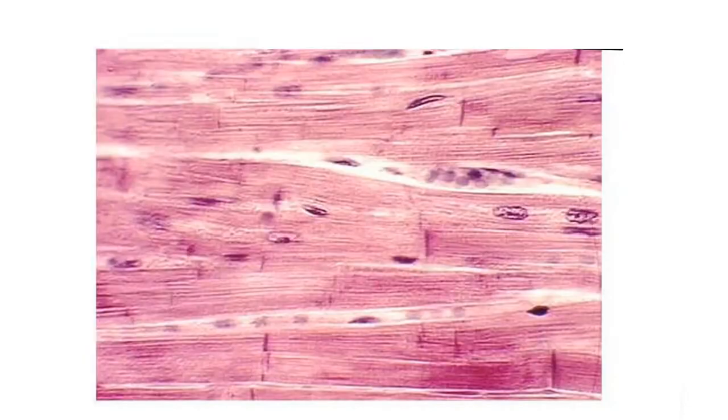Okay, first this may seem tricky, but I see this line and this line and this line and these lines here, which are screaming at me. Those are intercalated discs. And if I see the intercalated discs, I know I'm looking at cardiac muscle. Function, movement, of course, but to move blood, to pump blood out of the heart. Location, only the heart, especially the myocardial layer of the heart.